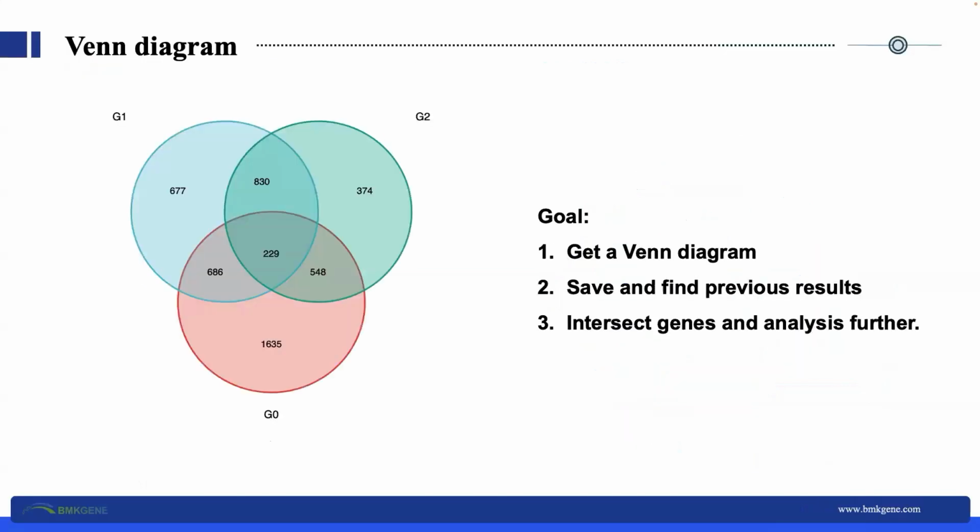Okay, I will show you. I did show the Venn diagram and selecting the intersect part, but for the whole Venn diagram, you can select any part of this group. You can choose this part. Not only the intersect part, but also this part and the non-intersecting part can be chosen.